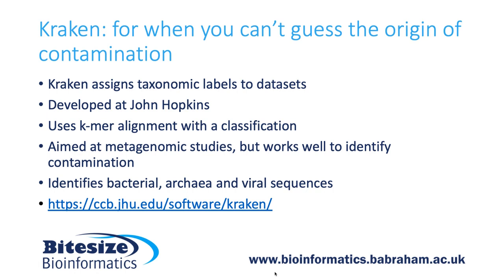However, there are situations when you'll get contamination in a sample and you won't know the source in advance. And for these situations, FastQ Screen simply won't identify it. This is because you won't have included your contamination species in your list of target genomes. FastQ Screen therefore won't search against that, and therefore all the reads which are the result of the contamination will be assigned to the no-hits category in FastQ Screen. So, is there anything you can do about this?